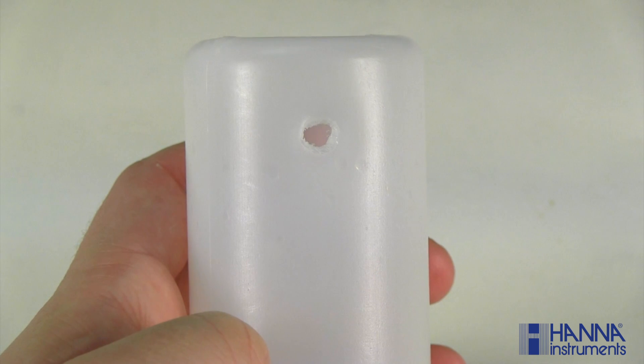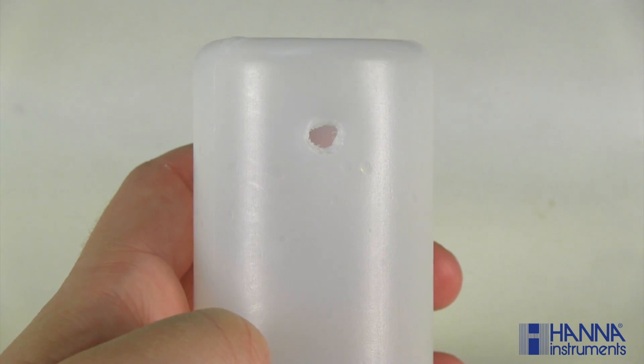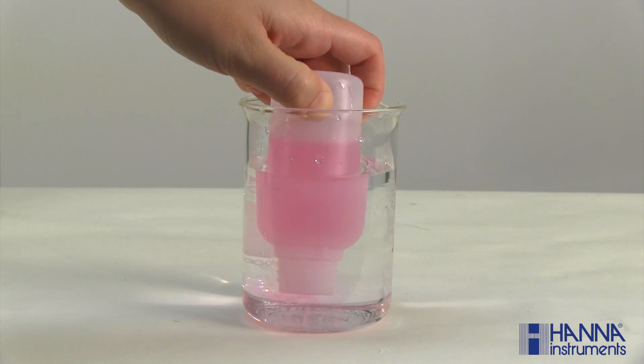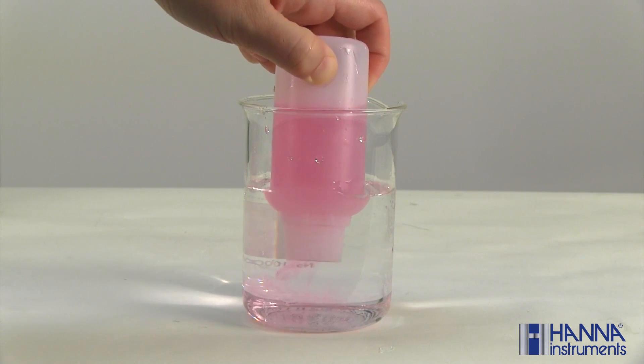This creates head pressure, allowing electrolyte to pass through the junction and into the sample being measured. If the fill hole is closed, the electrolyte will remain inside the chamber.